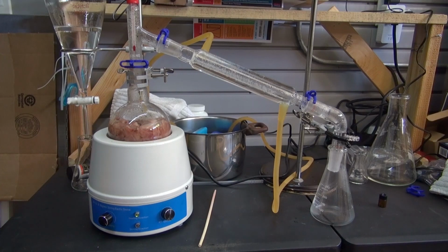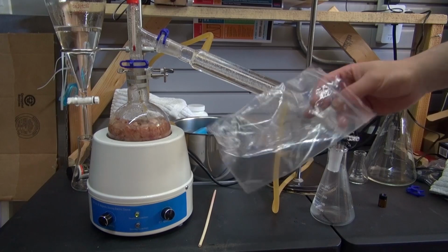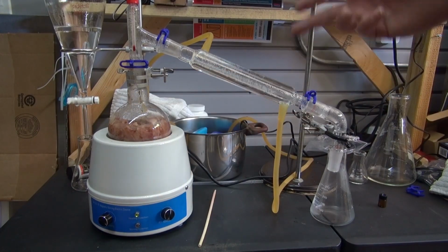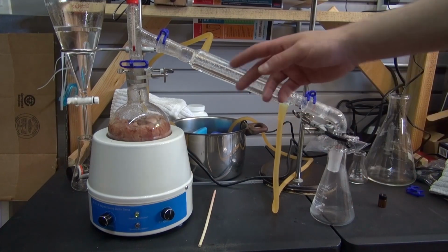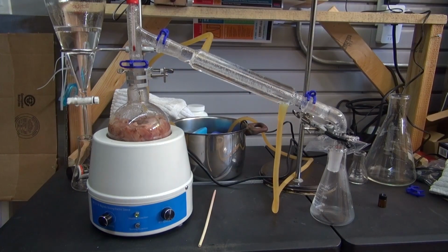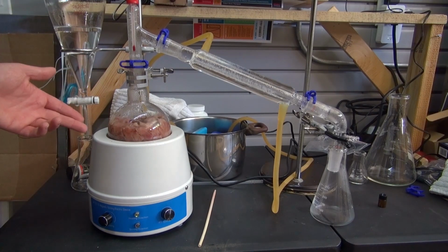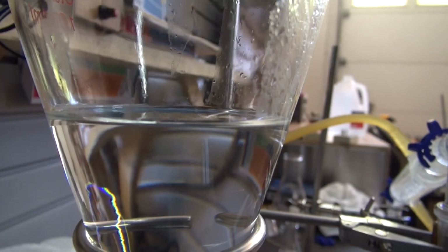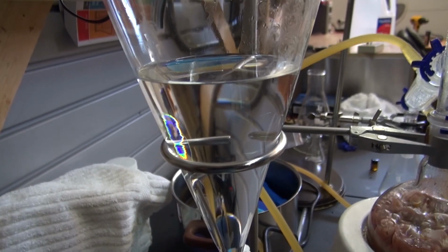Okay, so far I have emptied out the bag. All of the rose petals are now out of this bag, and this is my final batch. I did about three runs of this, filling up to about 200 milliliters each, and now this is my final batch, and I'm just going to boil it away until I see all of these rose petals become transparent. When they become transparent, I will then pour this final batch into the separatory funnel and see if I possibly collected some rose oil. If not, then it will just be pure rose hydrosol instead.